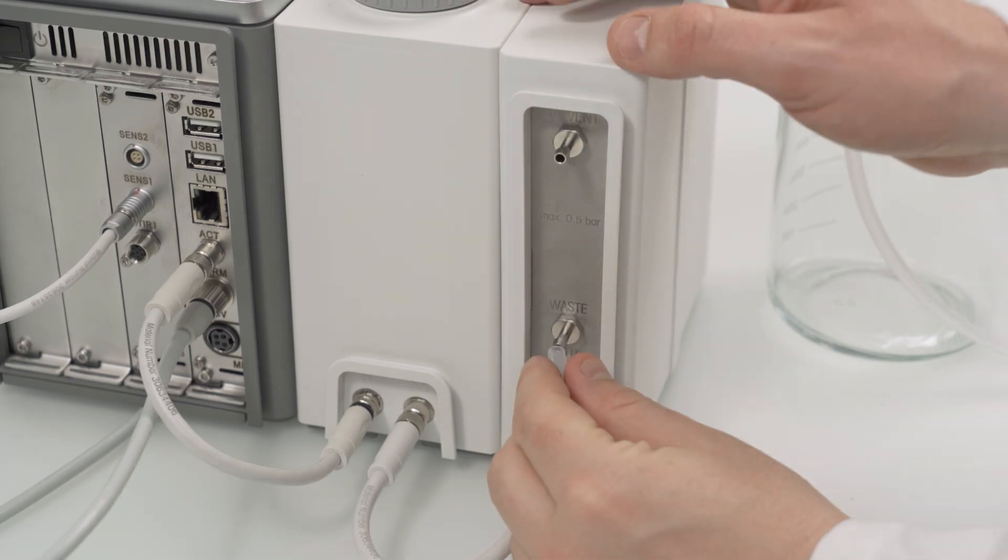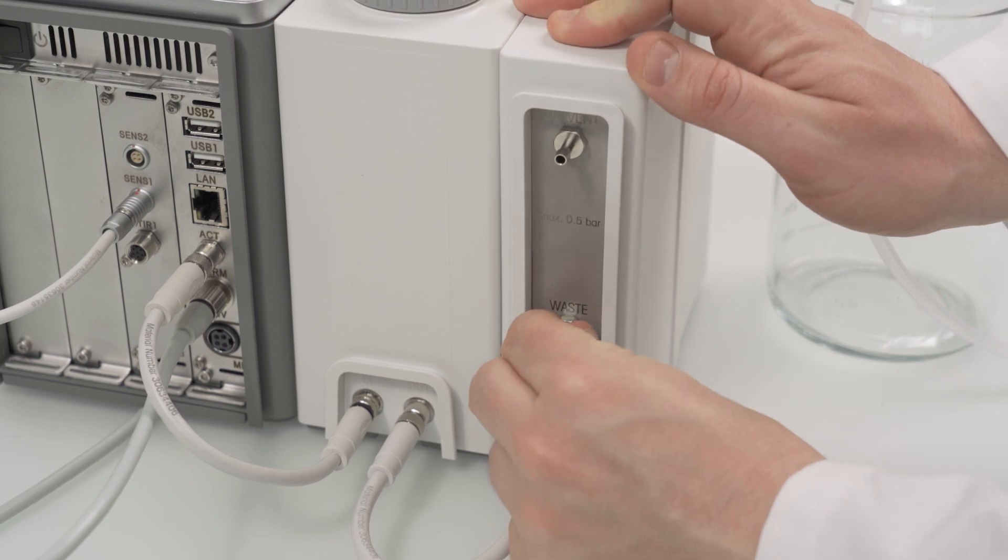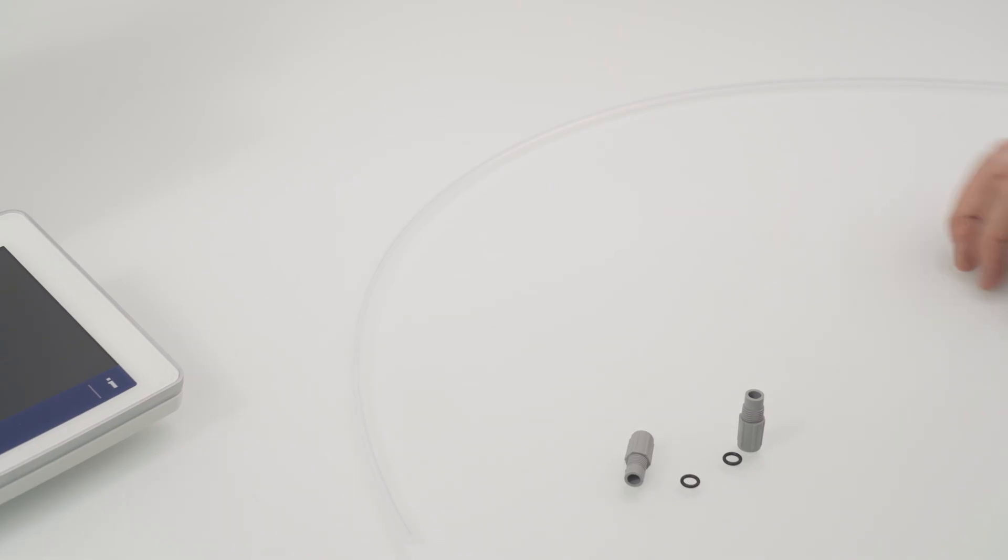Use one of the two long air tubes to connect the drying tube with the fitting on the back of the D-Pump KF.